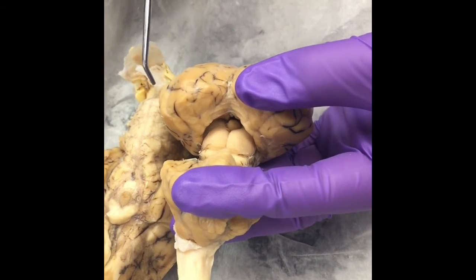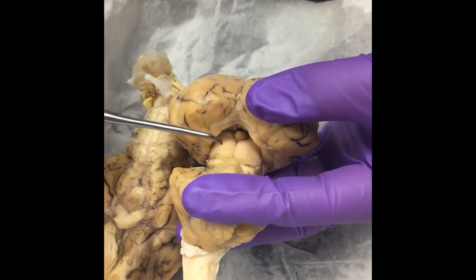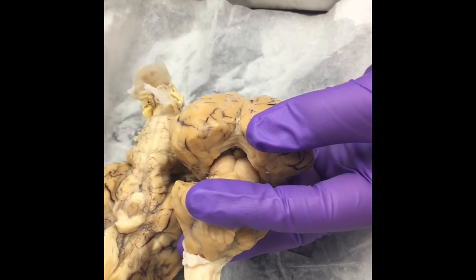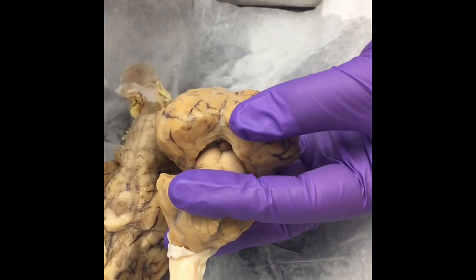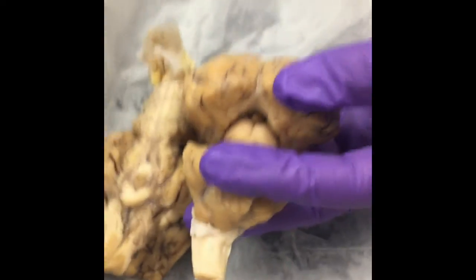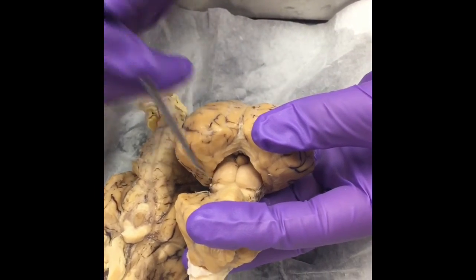Do you want to know what it does? Not really, but go ahead. Okay. So the superior colliculi give you the reflex where if you see something in your peripheral vision, you usually turn and look at it. That reflex comes from these guys. If you hear something, so say you hear somebody walking down the hall and you turn your head to look to see what it is, that's a reflex that comes from the inferior colliculi.